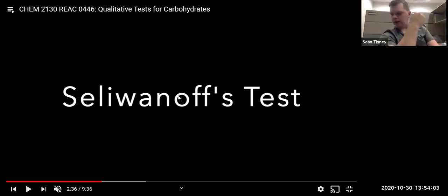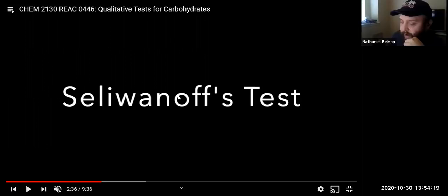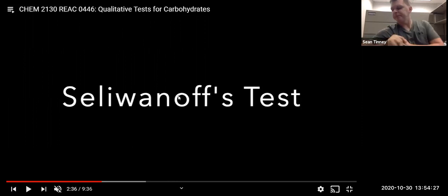So for the final line on that thing, for the BARFOED'S, on the elapsed, what are we going to put on that? We don't put the time that it actually went positive or negative, or are we just going to put positive, negative on it? Because it's got final, initial, and elapsed. So initial should be negative, final should be positive, and then elapsed time should be 10 minutes. Just want to make sure. Yep, no, you're fine.